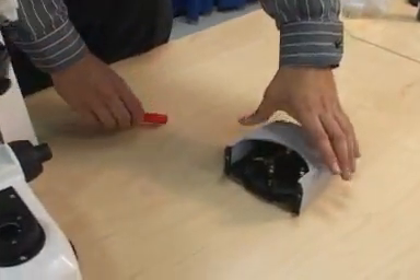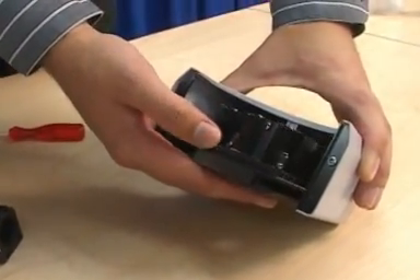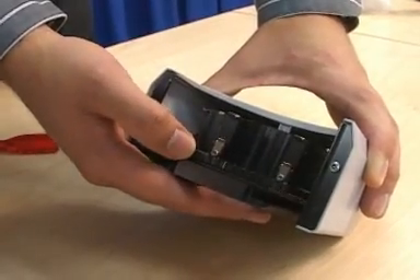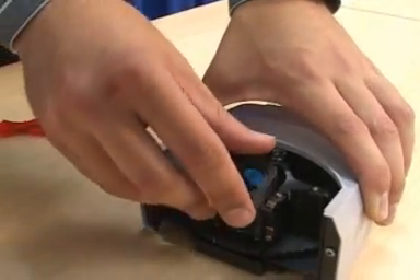Lay the reflector turret on the table upside down. Insert each filter cube into its own position by tilting the cube and sliding the plastic tabs on the side of the cube behind the metal clips in the turret. Push the cube into the turret — you should hear it click into place and it should feel tight.